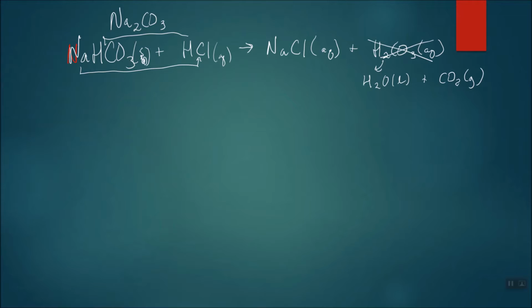So what do we know? We know that eventually we're going to need to make 1.00 grams of sodium chloride. The sheer power of stoichiometry is that if we know one thing for sure, in this case, that we need to produce 1.00 grams of NaCl, we can figure everything else out.